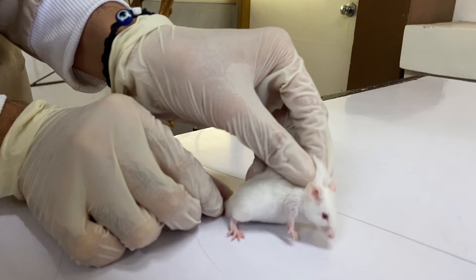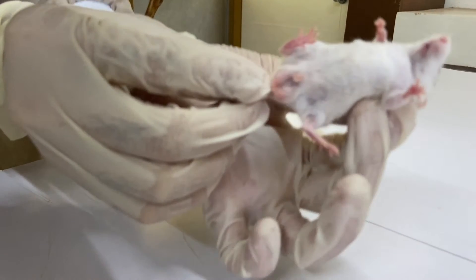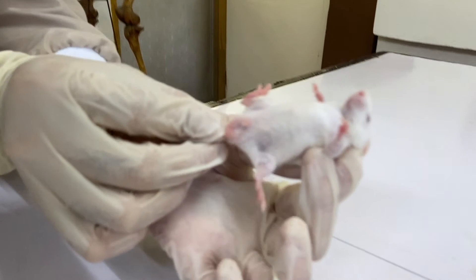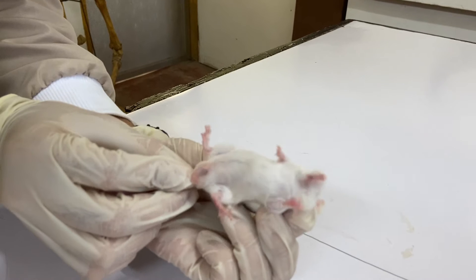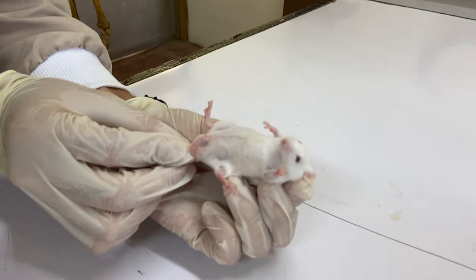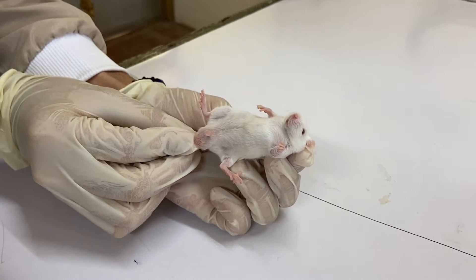Step 5: turn the hand upward so the mouse is positioned with its ventral side up. Step 6: secure the tail by gripping it between the ring or small finger and the ball of the thumb, or holding it with your other hand, whichever is more comfortable for the handler.